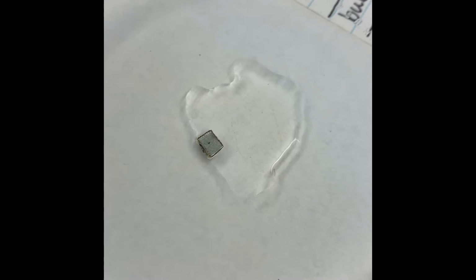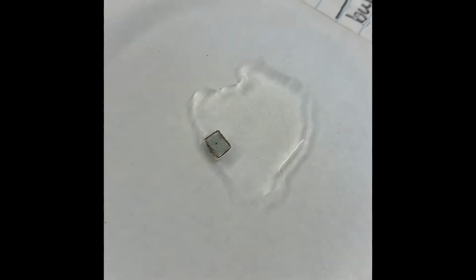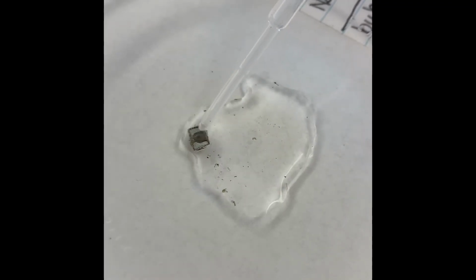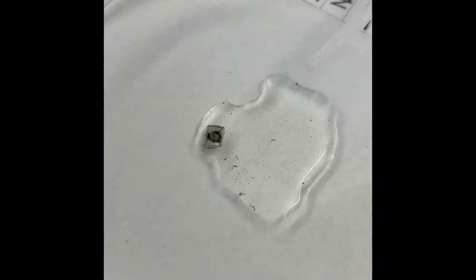It's looking like around the edges it's getting darker. The zinc foil is changing color. Let me try putting a little more silver nitrate on top of the zinc foil. Oh, it's just rolling off. All right, you see what's happening when I'm trying to drop it on the zinc foil? It's turning black. There we go, and looks like some bits are coming off of it.